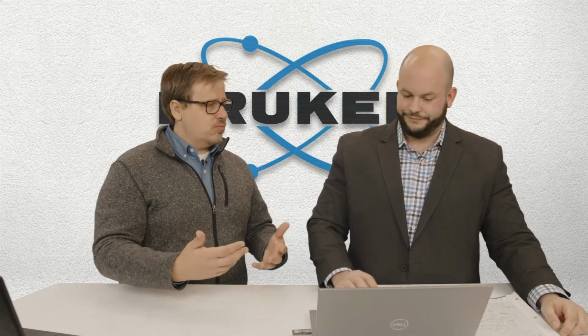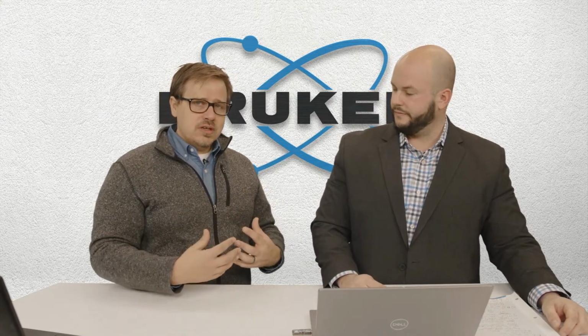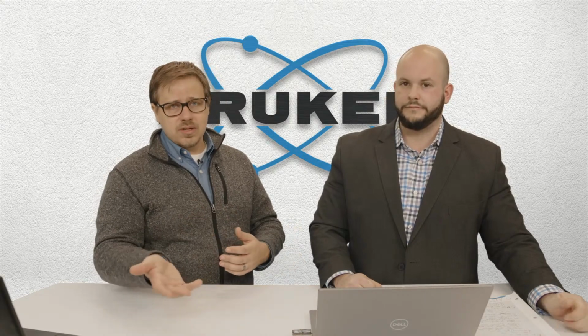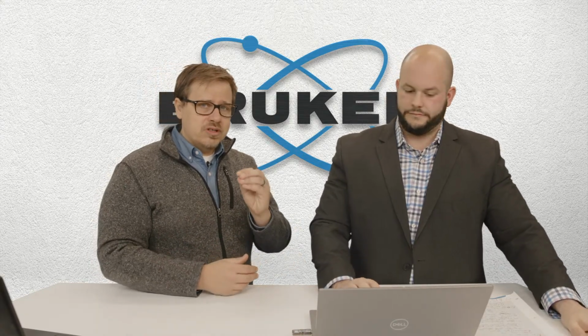So that's why it's important, as you had noted, when you bring a material in, you want to bring in the CIF file. Or you can bring in a structure file from something like an ICDD database or the COD database, that get CIF, but it brings in the atoms too. And so that'll help to refine that even further. Exactly, yeah, that'll give you the most complete information.